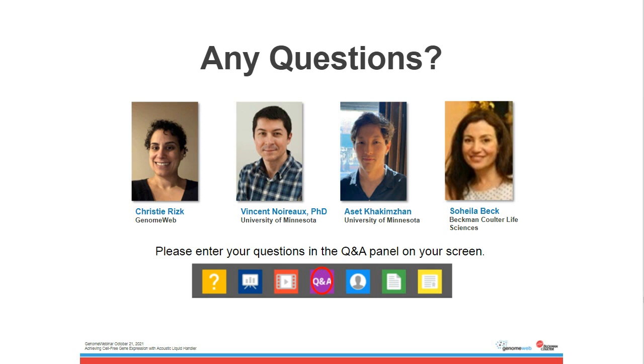Absolutely. So it's a very broad question. I will try to be brief. So TXTL, or if you like, cell-free gene expression right now, is attracting a lot of interest. There are more and more laboratories using cell-free gene expression, and for a number of applications that is also increasing every year.